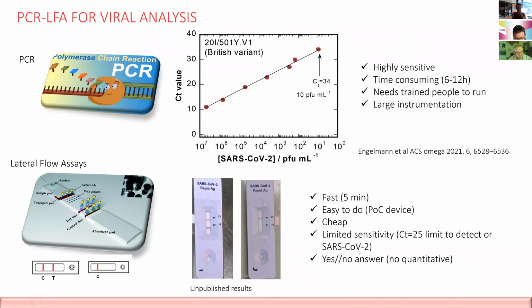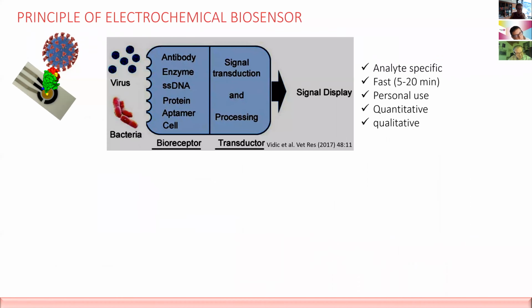But when you actually, and I simply take the example because we did this experiment, use a lateral flow assay for COVID, you can get a positive result only for CT values of 25. That means these are rather low detection limits for viruses, which made us look for other methods. So you either amplify this kind of lateral flow assay, or you do like we decided and go for an electrochemical biosensor, which can also give you a quick result if you get the right ligand on it.